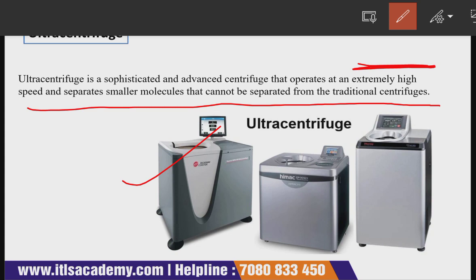So you can say this centrifugation has a very high speed, and it is a very essential device in any biology or chemistry laboratory, and it is used for day-to-day experiments conducted in laboratories. It has a very wide application whenever you want to isolate a smaller sized particle, or if you want to study the purification of molecules or molecule complexes, then this centrifugation is used.